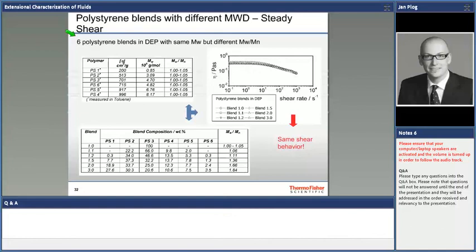They approached us asking if we can find the answer for that. So what we did is to show the feasibility of that. We designed some very specific polymer blends first to see how sensitive the CaBER actually is.